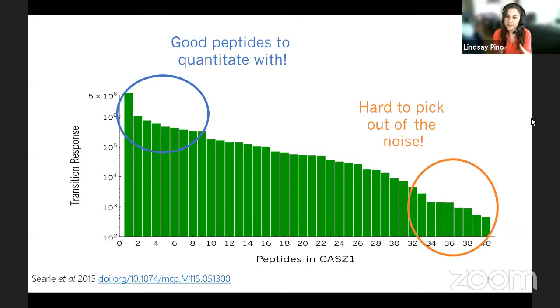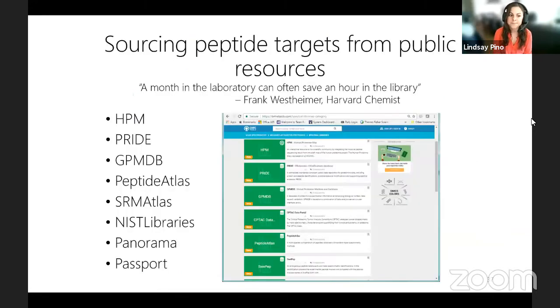So you might also imagine, well, if they're all equimolar peptides, they should all have the same signal. They should all be similarly abundant. But that's clearly, in this figure, not the case. Some peptides digest really well and are released from the protein very easily. Some peptides, so-called, fly very well in the mass spectrometer versus others that don't. Some peptides fragment very well and give very high intensity fragments. Some peptides do not fragment very well and give very low intensity.